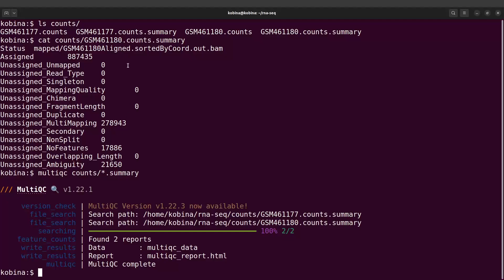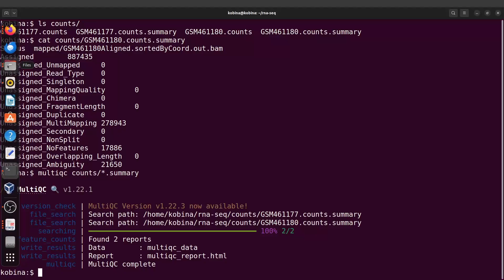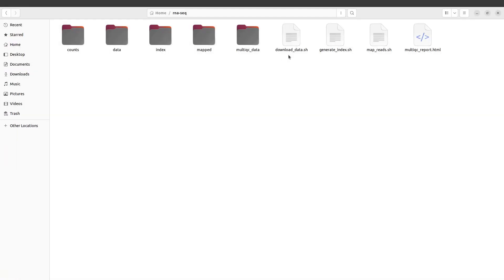Once it's done, I can check it out. I'll do that now with my file manager.